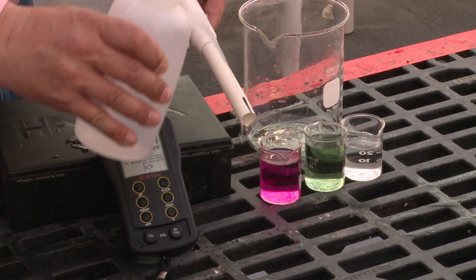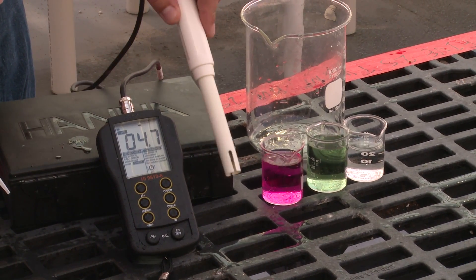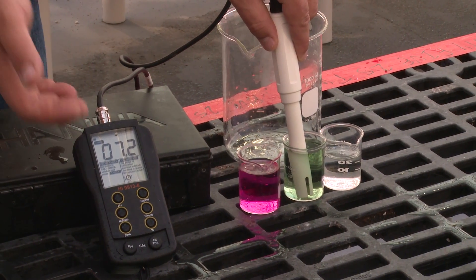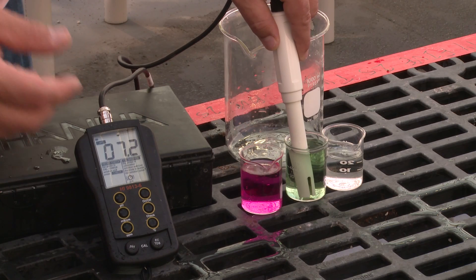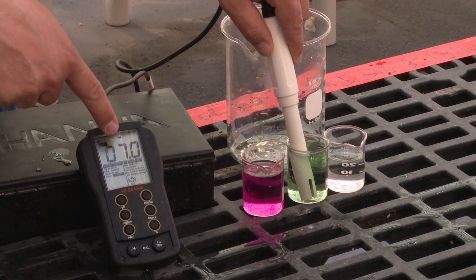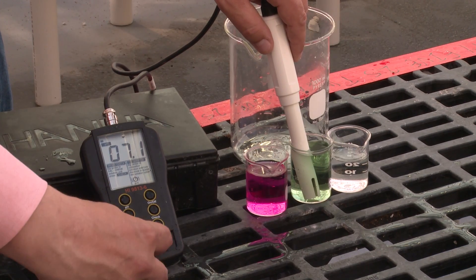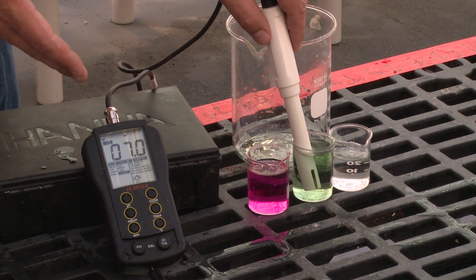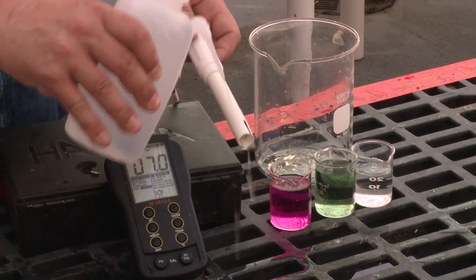Now again, we want to rinse our probe tips between calibrations. Next, we're going to calibrate the high end of the readings. This next solution has a pH of 7. You can see that our reference solution has a pH of 7, but our reading is 7.2, so we need to lower it. Again, we dial back until the meter is reading the same as our solution. Sometimes it's good to give it a minute or try and bring it a little bit lower. We've got a reading of 7.0 now — our meter is calibrated for pH readings. Remove the probe and rinse the tip.